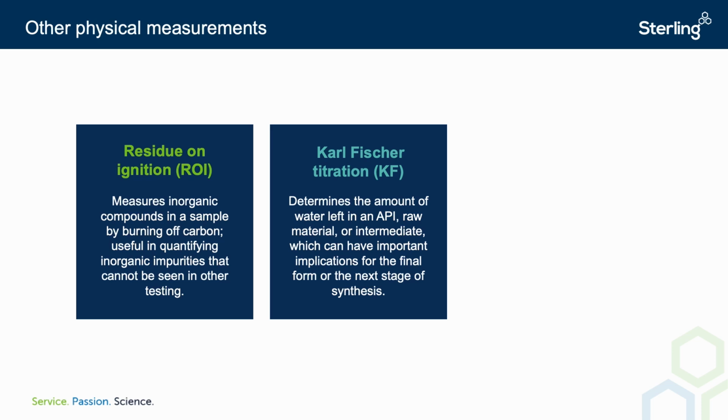Coulometric KF is another technique, also known as CKF. This measures very low levels of water in the sample. This method is similar in that the measured iodine is equivalent to the amount of water, but more chemical reactions are taking place to get to the same result. This method is much more sensitive and allows for lower detection limits of water, as it uses an electrochemical endpoint for its determination.